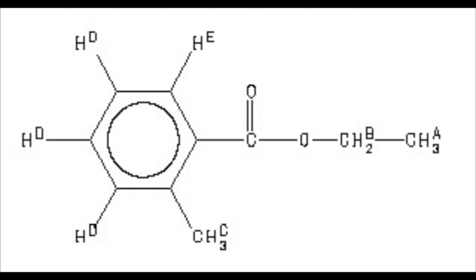So anyway, just to recap with this molecule, this one has three sp3 carbons, A, B, and C. A is the one with the triplet, B is the one with the quartet that's downfield due to the O, and C is the one that's a singlet because it's next to no other hydrogens. And the signals from E and D are at about 7.5. So that's what we get from the H NMR for this particular molecule.